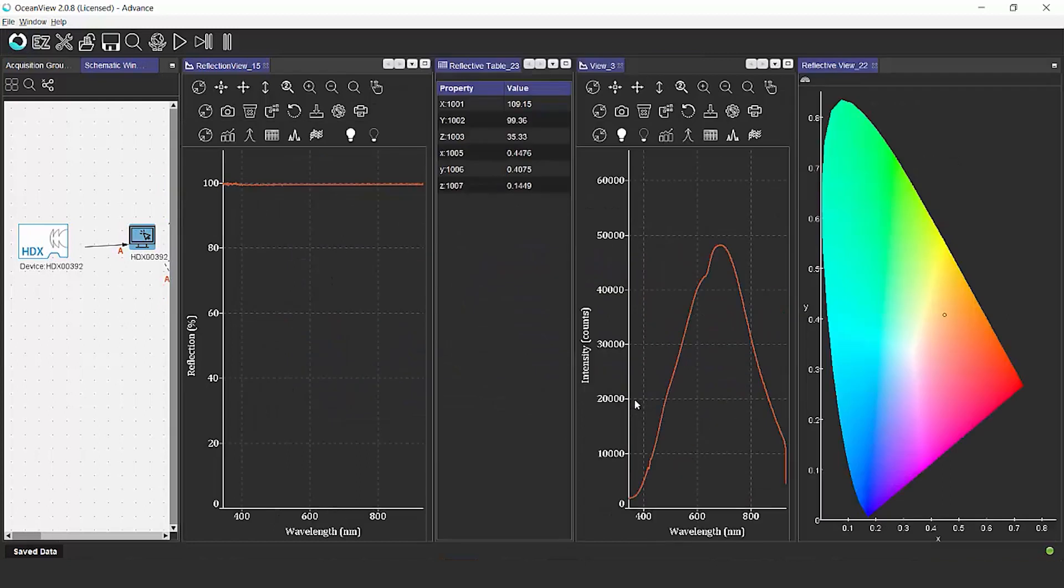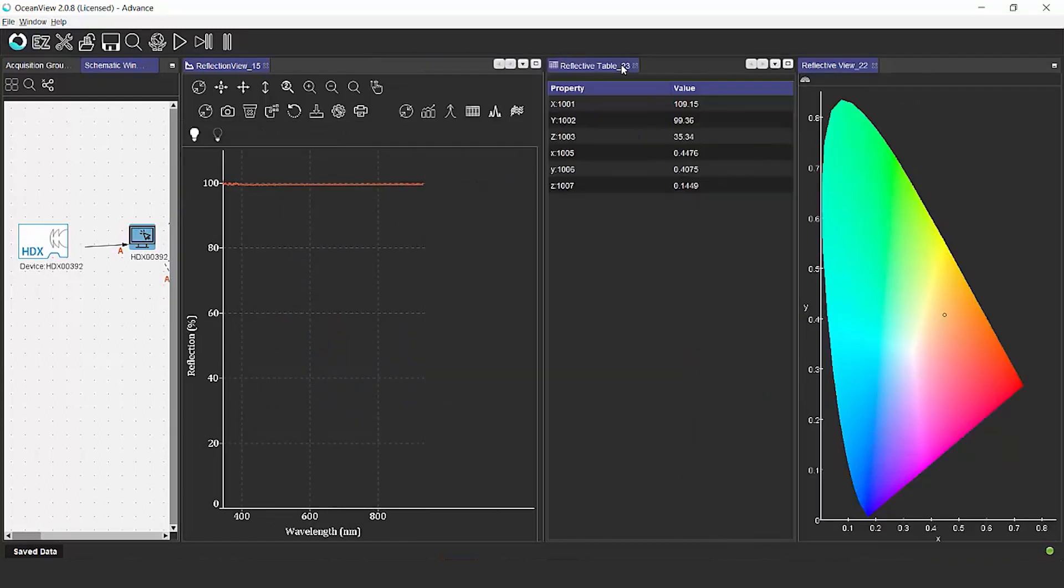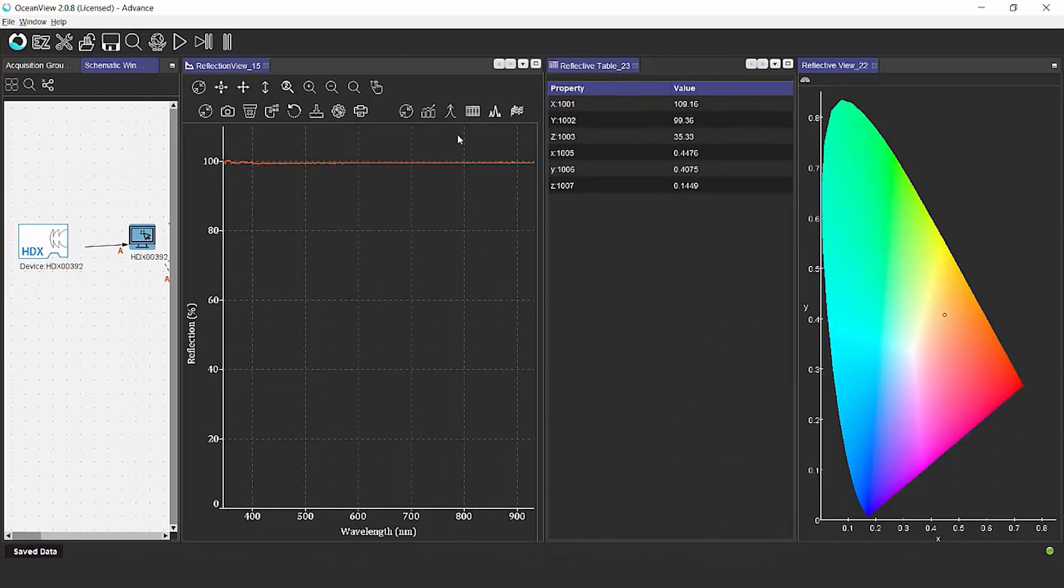Using this, we can actually see in CIE color space where our colors are falling. And what you'll see in the software is changes in the chromaticity diagram as we look at different colors.